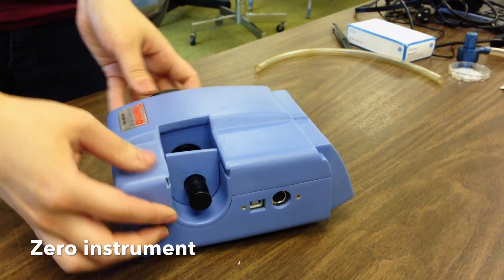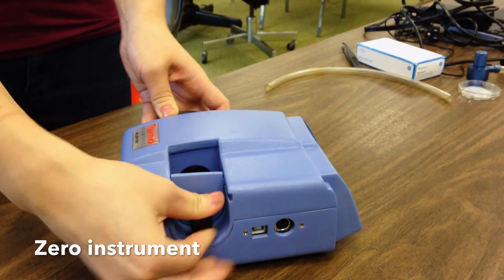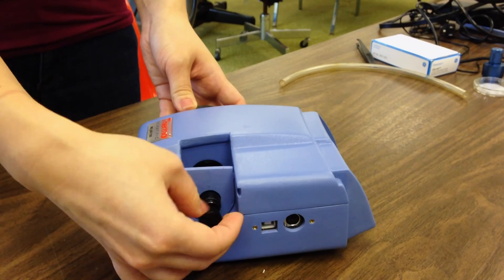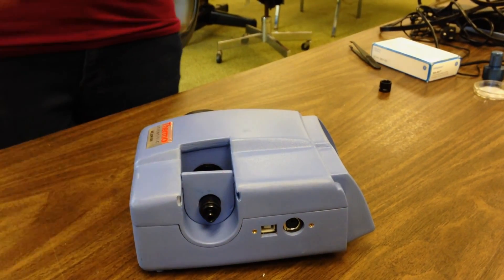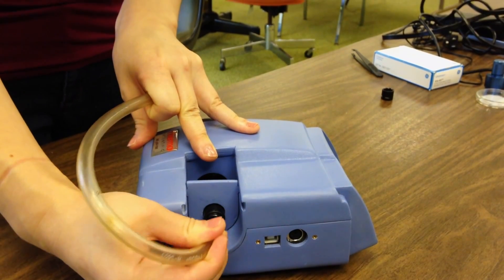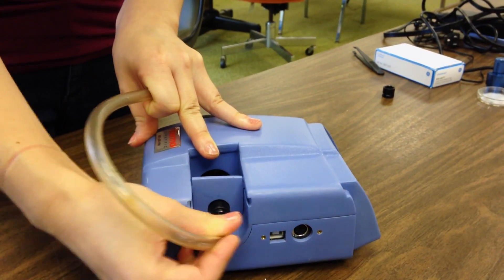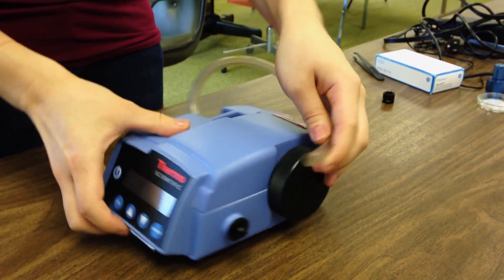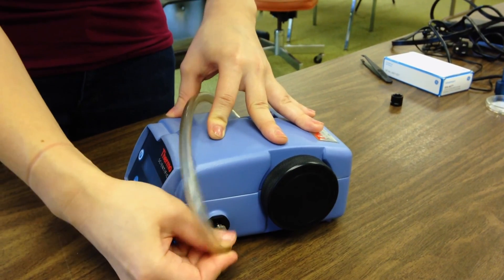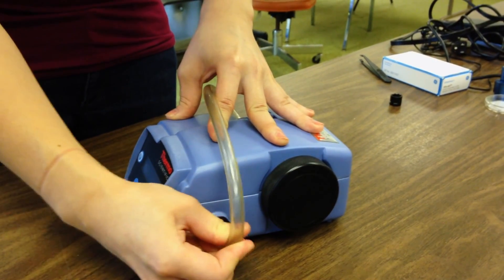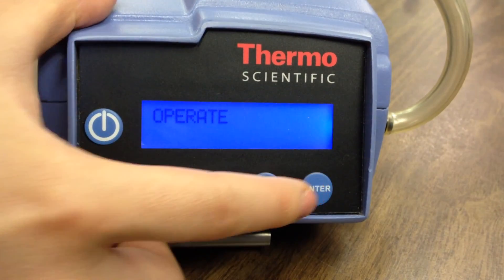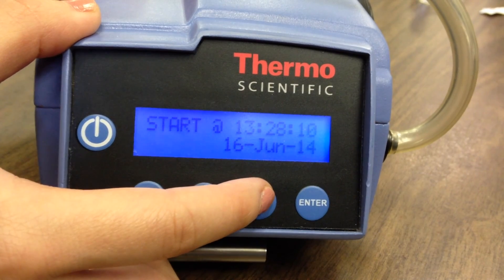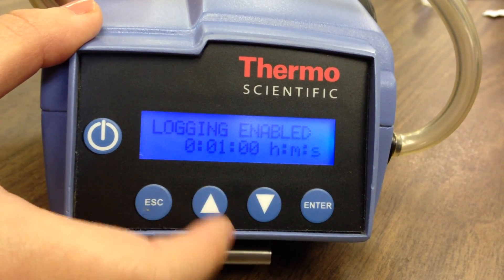In order to calibrate your PDR, unscrew the cap of your black total inlet piece. Connect one end of your tubing to the total inlet and then connect the other end to the total outlet of the PDR. From the OPERATE menu, press the ENTER key and then scroll down to the zero instrument screen. Then press ENTER to begin zeroing the instrument.